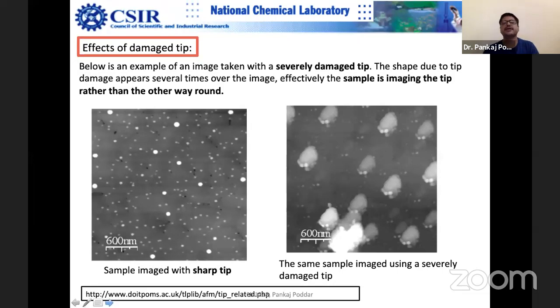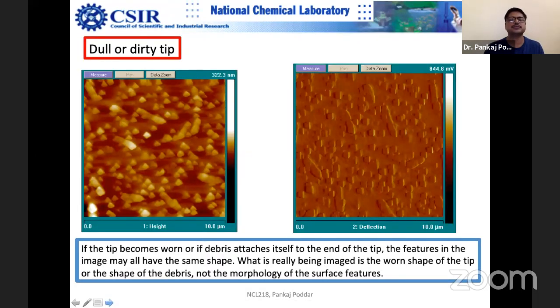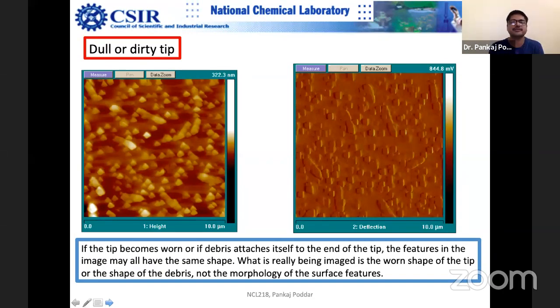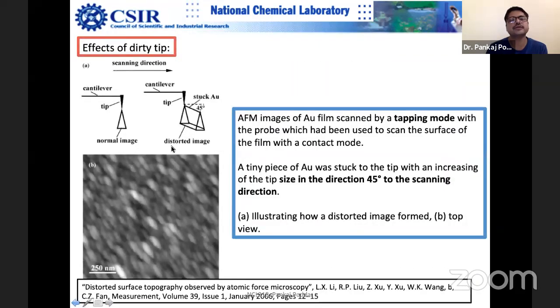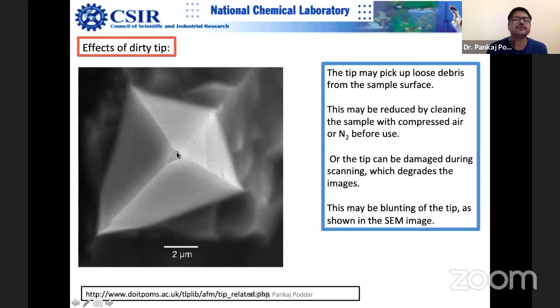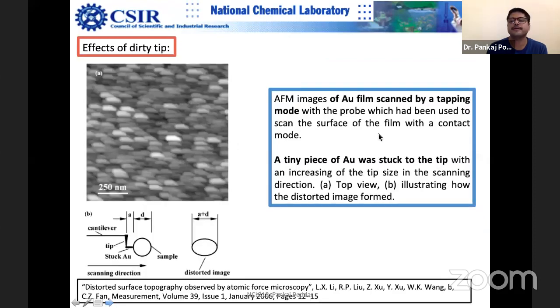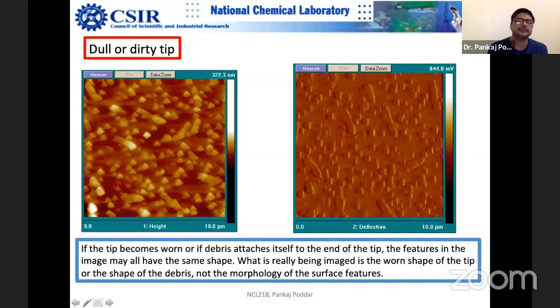This example is from my own lab. What you are looking at is actually the tip shape being imaged — not the sample. You can see this triangular pattern which is the blunt tip shape. When the tip is chopped off, you get something like a truncated pyramid. Be very careful about what you're measuring. These are all blunt tip images. The dirty tip shows height and deflection images with artifacts, essentially showing an inverted blunt pyramidal shape.